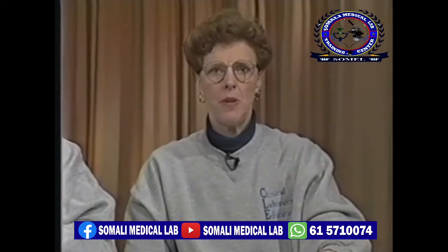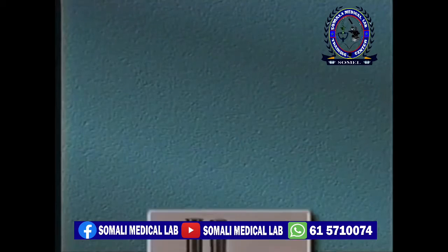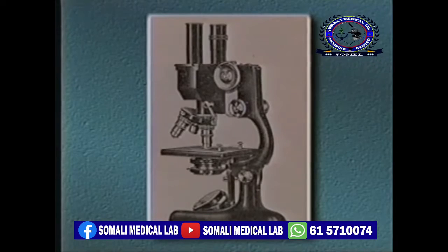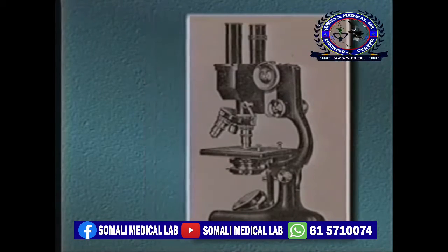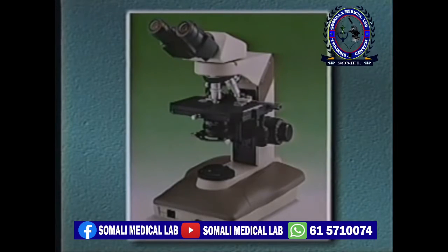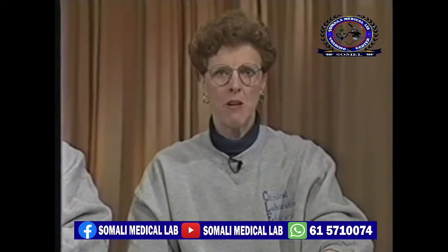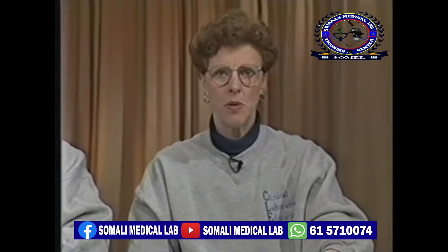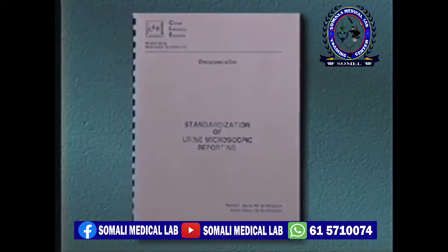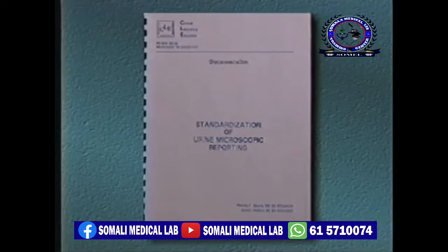As you can tell, we strongly recommend the use of phase microscopy. In the past, the oldest microscope in the lab was placed in the urine laboratory when new ones were purchased. If possible, having a quality microscope with phase capabilities helps in the performance of microscopics. If you do not use phase microscopy, it is helpful to use one of the many urine stains commercially available. In your documentation is a chart to use to standardize urine microscopic reporting.